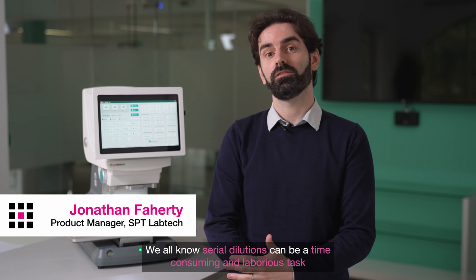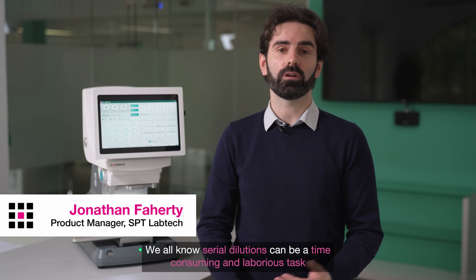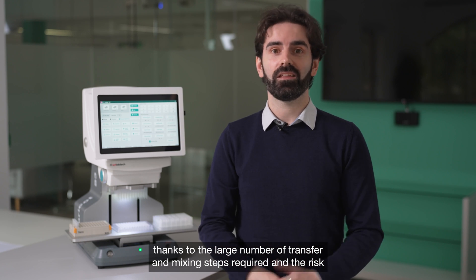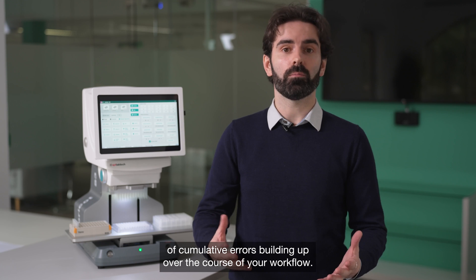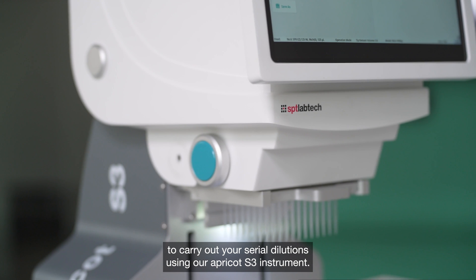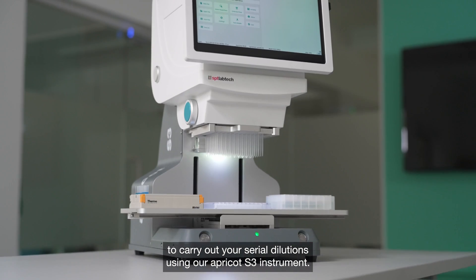Hi there. We all know serial dilutions can be a time-consuming and laborious task, thanks to the large number of transfer and mixing steps required, and the risk of cumulative errors building up over the course of your workflow. I'm Jonathan from SPT Labtech, and I'd like to show you a better way to carry out your serial dilutions using our Apricot S3 instrument.